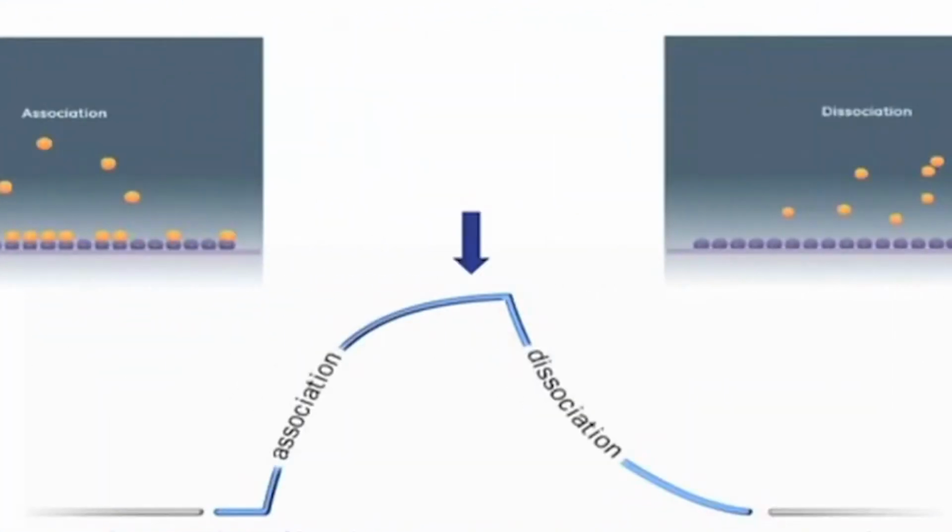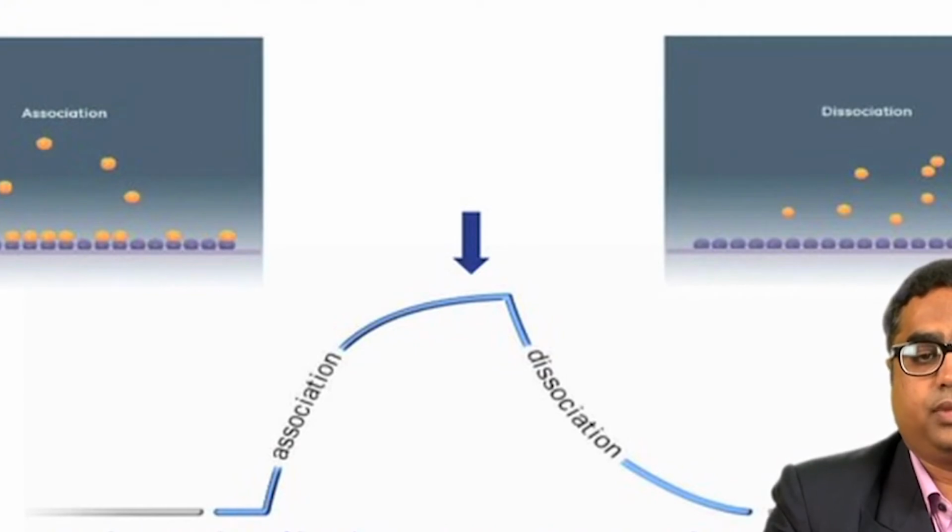Before we start with other sessions, I think we will revise a little bit of introductory slides on the surface plasmon resonance. A Biacore or surface plasmon resonance system is a label-free technology. These systems are generally used to monitor molecular binding events in real time. So basically an experiment starts with an immobilization of a ligand on the sensor surface, and an analyte is passed over in a solution and will bind to the ligand. So here there are two different molecules, one of them is a ligand and the other is the analyte.